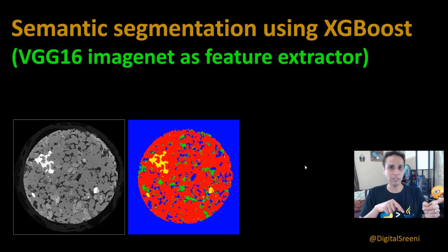In this example that we're going to use, each pixel can be classified into one of four. Okay, so as you can see, I have four different classes, the blue, yellow, green, or red. So this is four different classes, and I'm classifying each pixel. Which means we have tremendous data that needs to be processed. Okay, and XGBoost is supposed to be optimized for speed compared to random forest. So let's hope that this gives us results in a quicker way compared to random forest.